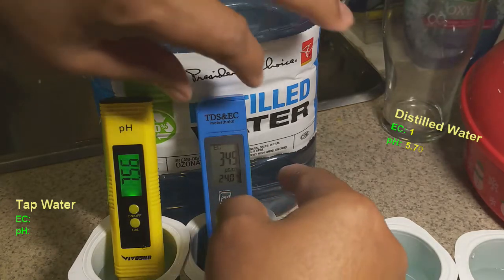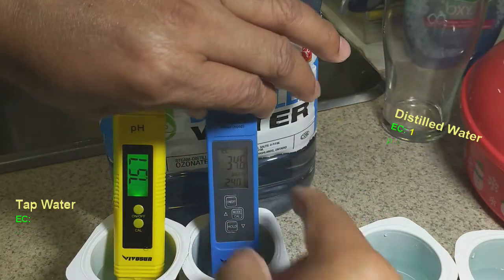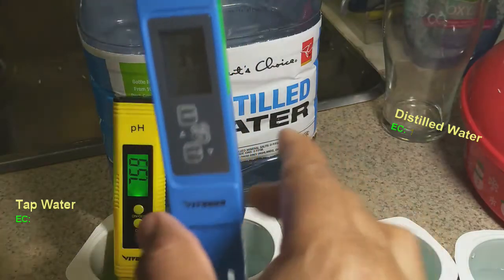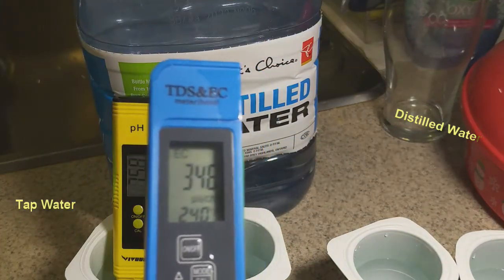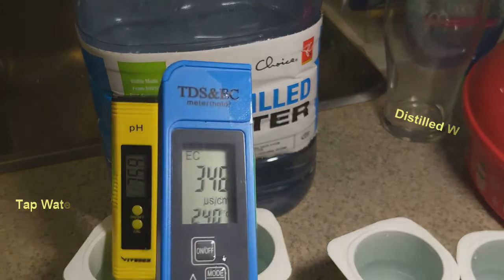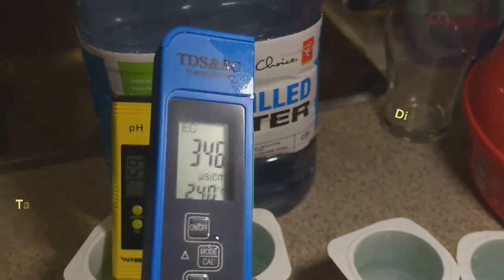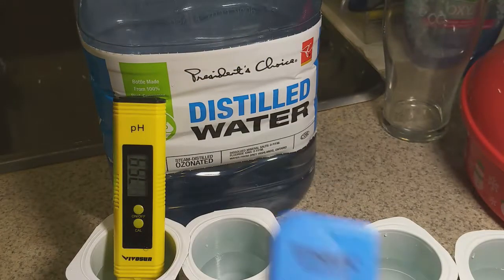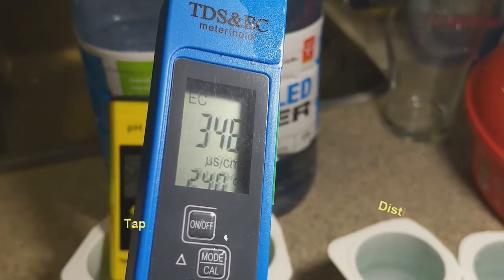I'm going to press hold on this one so I can bring it closer. The tap water has an EC of 346 — 344, looks like about 346. The temperature is 24 degrees.